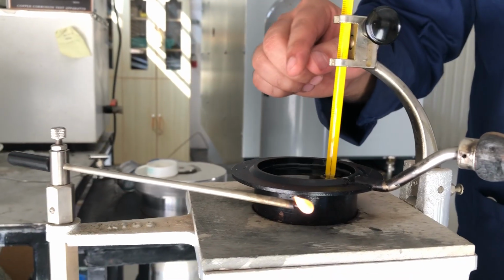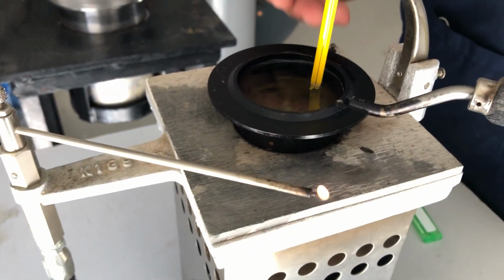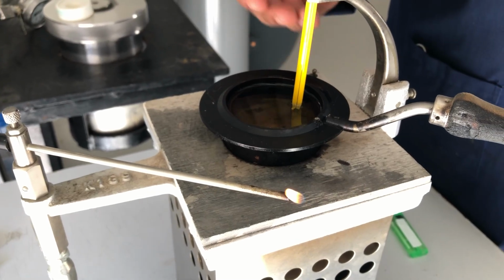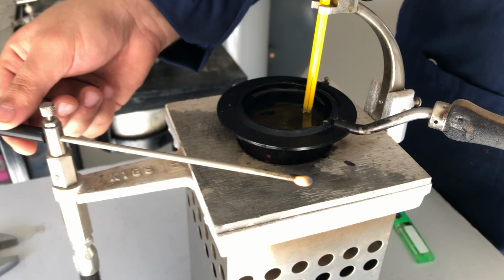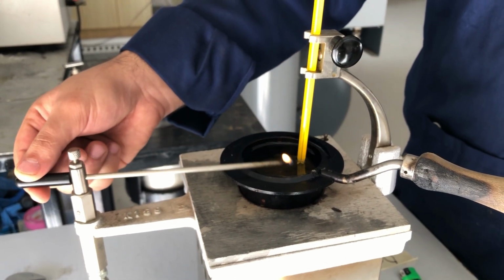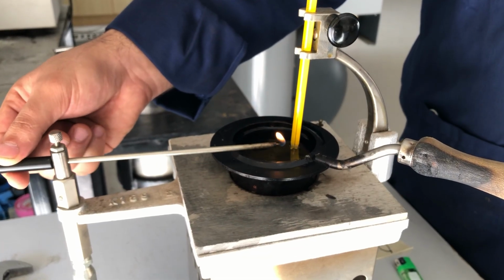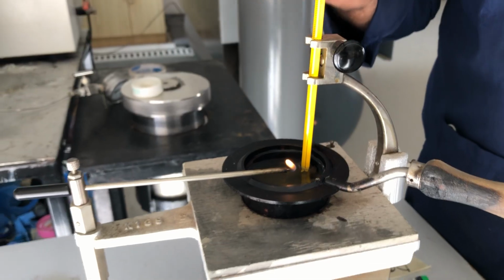So after some time of heating, we see that the oil is vaporizing. You see that some smoke is coming. We always have to keep passing this flame at the surface of the oil. If the amount of vapor is enough, it will make a flash.